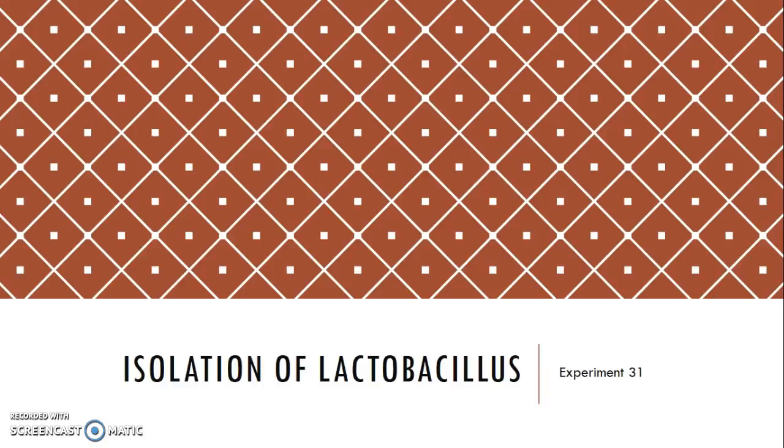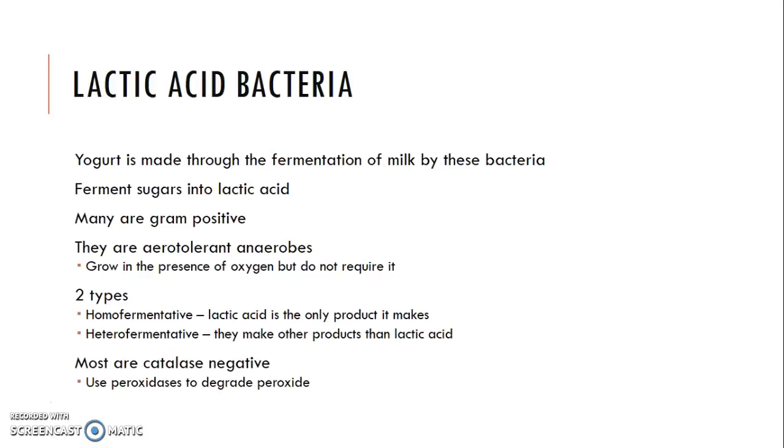We're at our isolation stage right here. Last lab we did isolation of Streptococcus. This lab we're doing isolation of Lactobacillus. Next lab I think we're doing Streptococcus. So we're isolating bacteria right now, which is an important thing to do in microbiology.